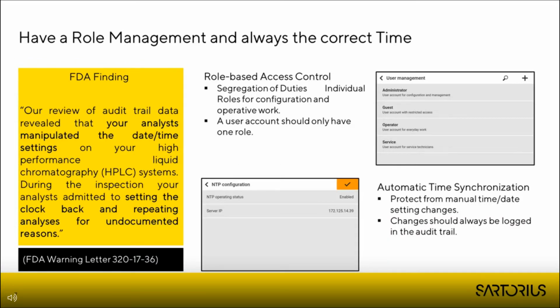Yeah, the next problem is also a very common one regarding user management or user accounts, and this is when a user has too many rights on a computerized system and can use these rights to manipulate data or experiment results.